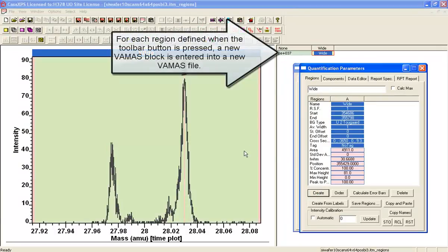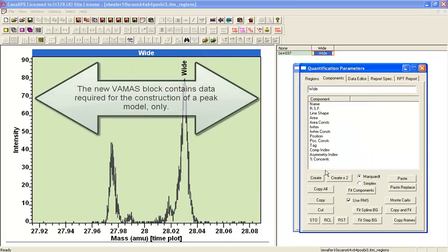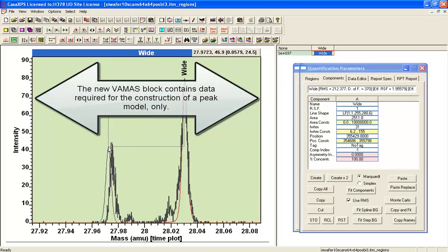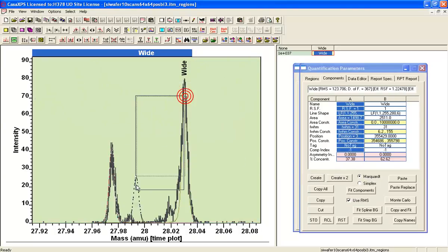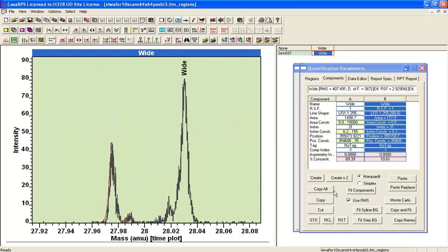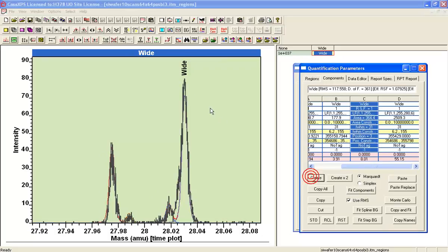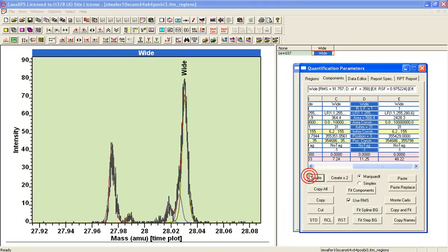and I can then do a peak fit. So put a background on, let's just again put a 0 on there, and we'll just create some peaks. There's one. I'll just move a peak, create it. There's another one, I'll move that peak, create a peak, and again I'm going to move them to peaks that I can see in the data clearly.